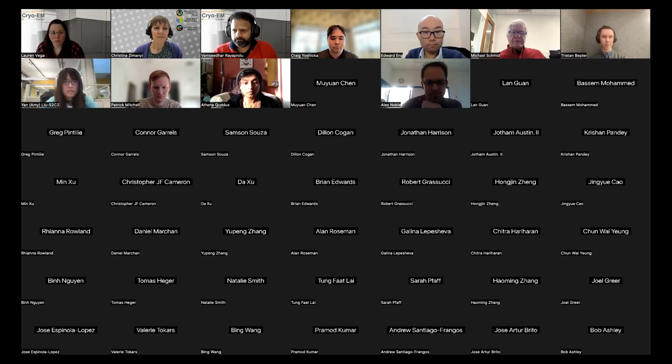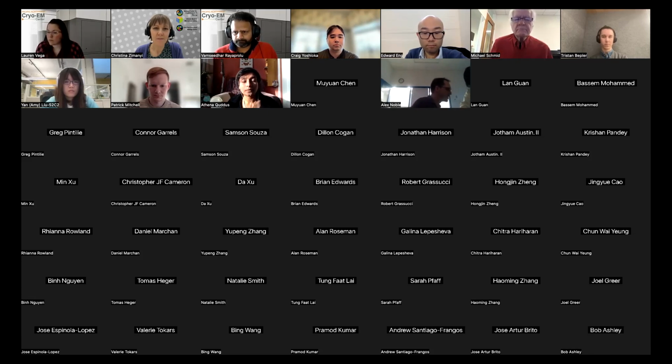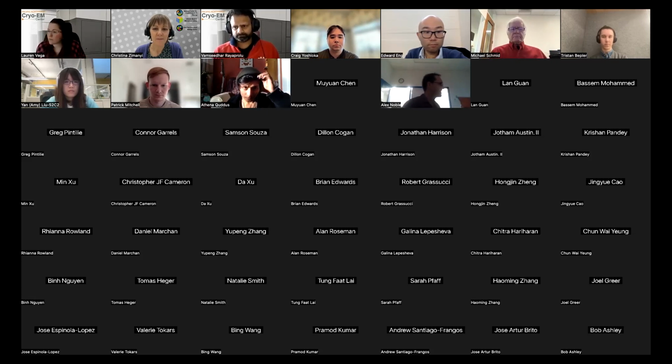Muyuan, you mentioned that the EMAN version of the particle picker is in fact able to pick things from tomograms. Can you describe that a little bit? Oh, yes, that thing has been there for a while. There's an e2spt_boxer_convnet or something that you can find through the project manager GUI that lets you go through a whole entire data set of tomograms and pick particles. I mean, it's been there. It's just if you're using Relion or IMOD or something, it's not integrated. So.